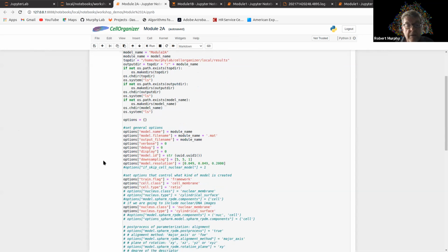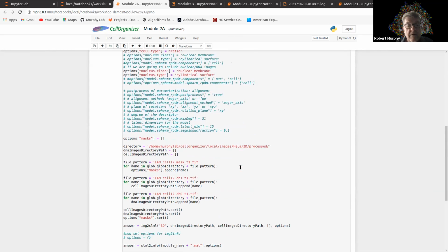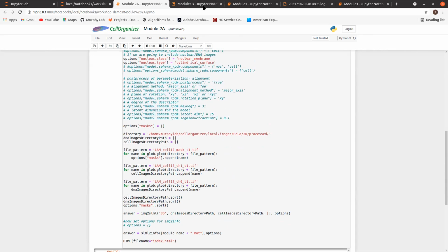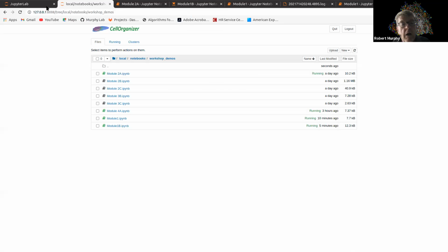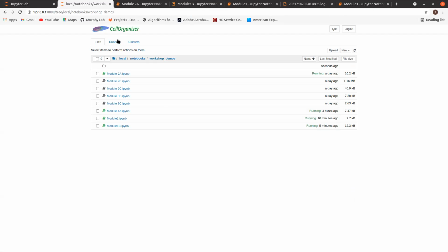So if you scroll down a little bit, this should all look very familiar. It doesn't have the 3 different options. It's just using one of the ways to read the files. And I guess you can go ahead and run this. I need to start the other one. Right. Give me 1 second.